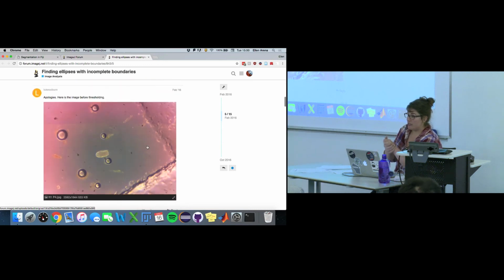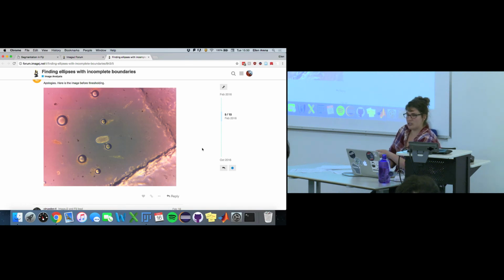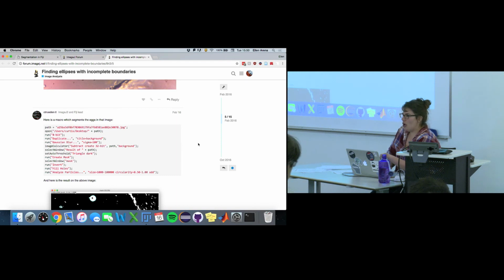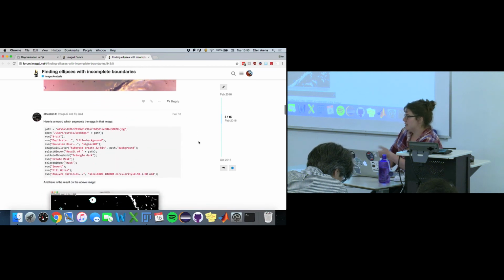So my colleague Curtis, who is a computer scientist, is a guru when it comes to computer science, but he's not a biologist. He got to the office early one morning, and I was sitting next to him, and he was typing away. I wasn't really looking at what he was doing, but he was answering this user's post. Curtis spent about 20, 30 minutes, and he came out with this amazing script for this user to segment these eggs. And he's like, here you go, boom, run this script. You've got amazing segmentation. Look at this. In this particular image, you have 1, 2, 3, 4, 5, 6 eggs.